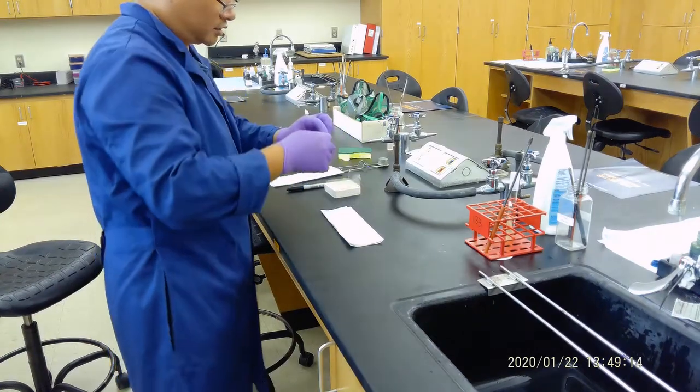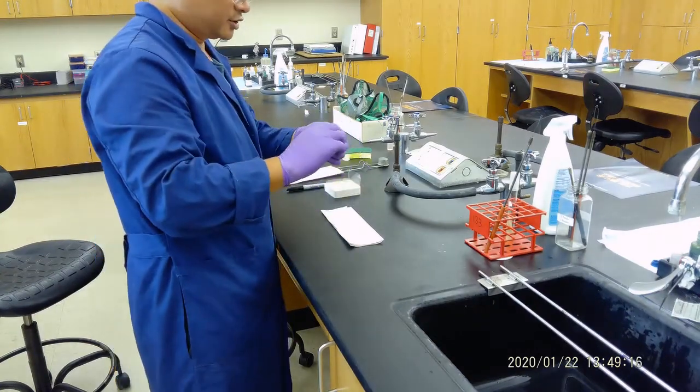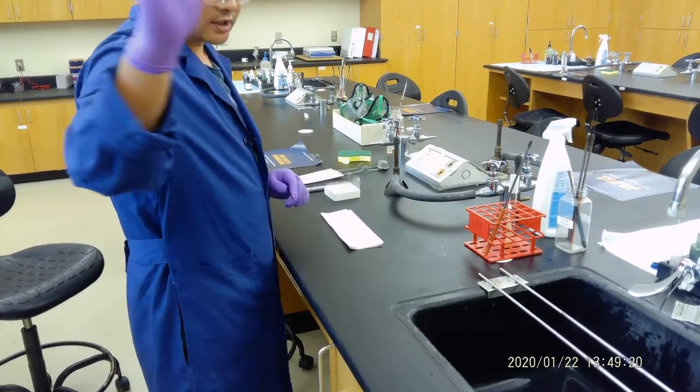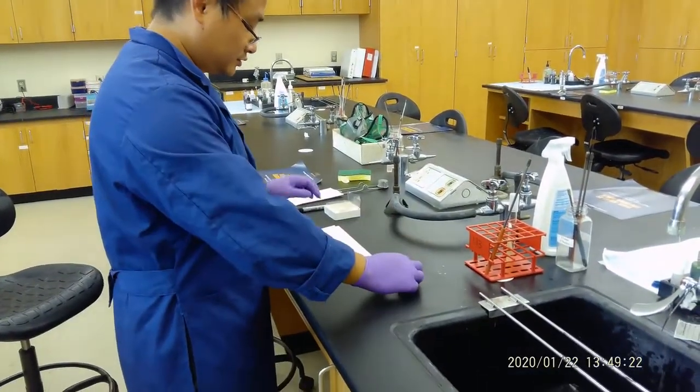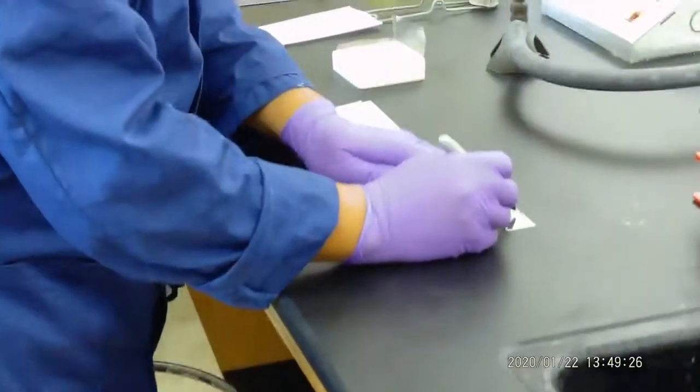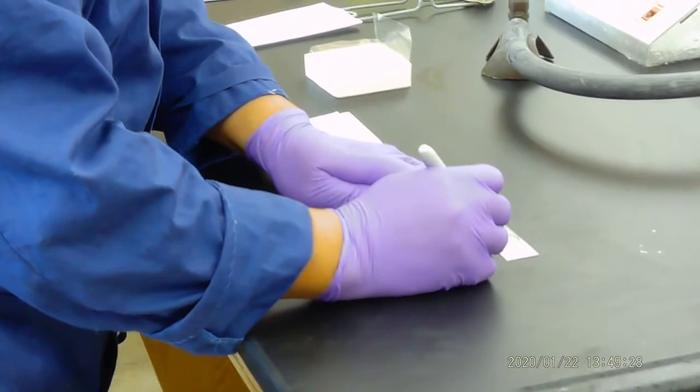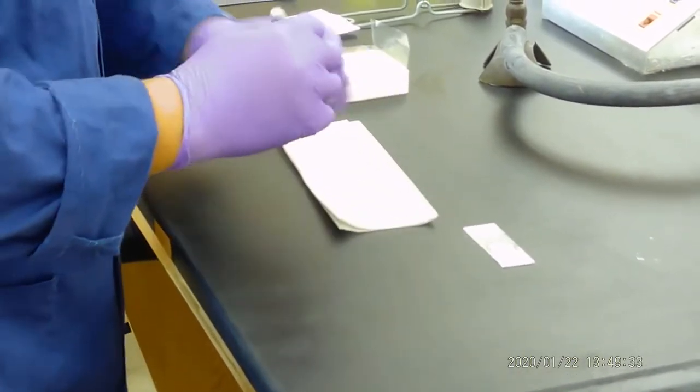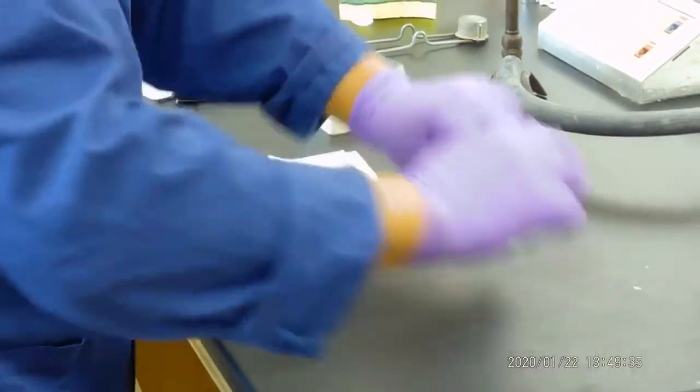Today we're going to do the simple stain for you. The first step is we're going to get glass slides. The second step we will do a label, always make sure you're labeled. So we draw a big circle and write SA on the side. This is our log slide.